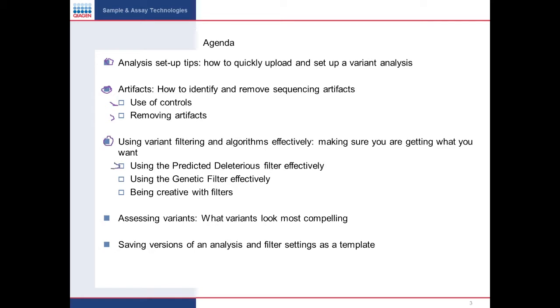We'll hit primarily on the predicted deleterious filter and the genetic analysis filter, and you'll see as we go through today, just how to be creative with some of these filters in the filter cascade and analyzing those variants.